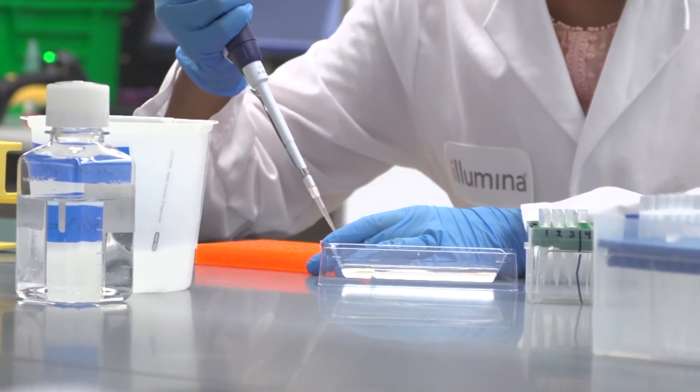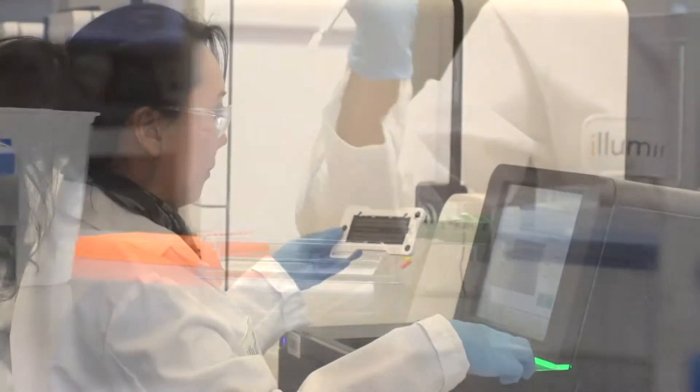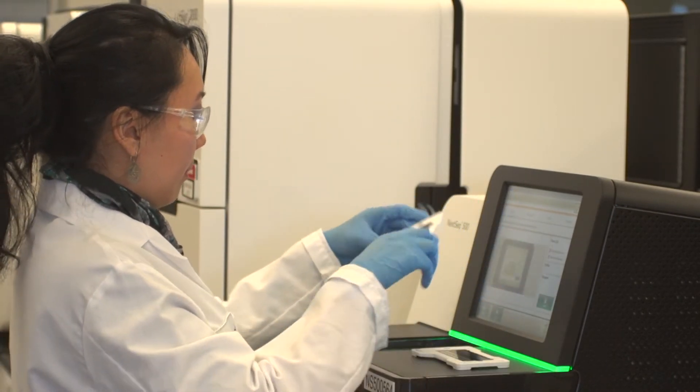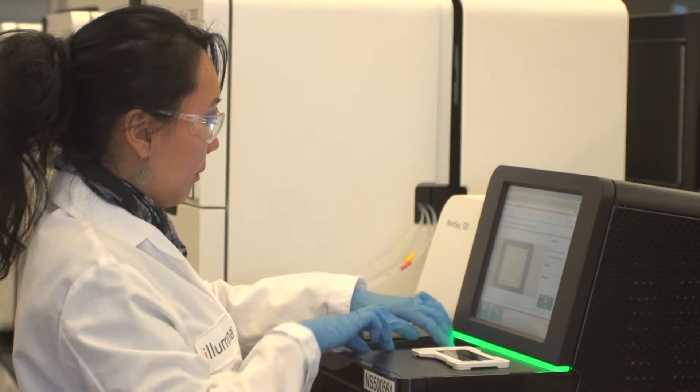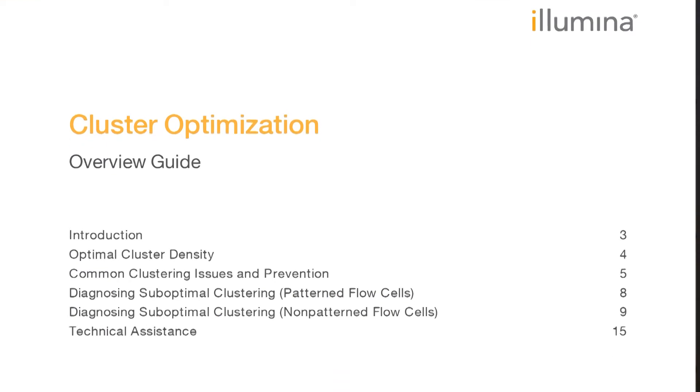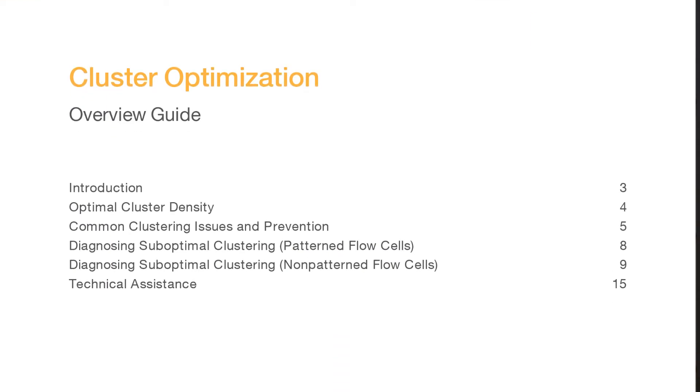Achieving optimal cluster density for your sequencing runs is the first step in maximizing the output and efficiency of your Illumina sequencing instrument. I'm Tim Gilmartin, a staff field application scientist with Illumina. And I'm Michelle Yeh, a staff technical application scientist with Illumina. In this video, we will discuss optimal cluster density and how over and under clustering can affect your sequencing data. We will then examine common clustering issues and ways to prevent them. Please use the cluster optimization overview guide found on the Illumina Support website as the official cluster optimization resource.